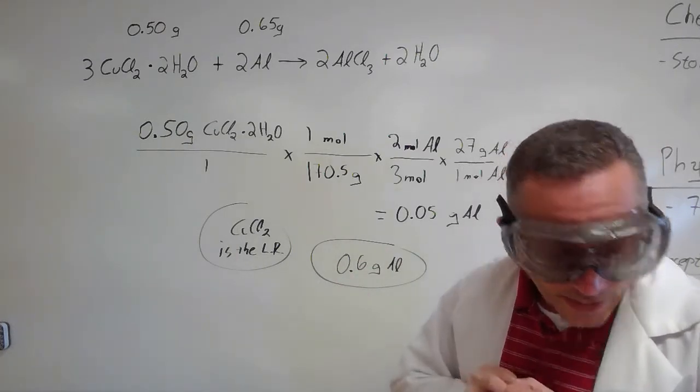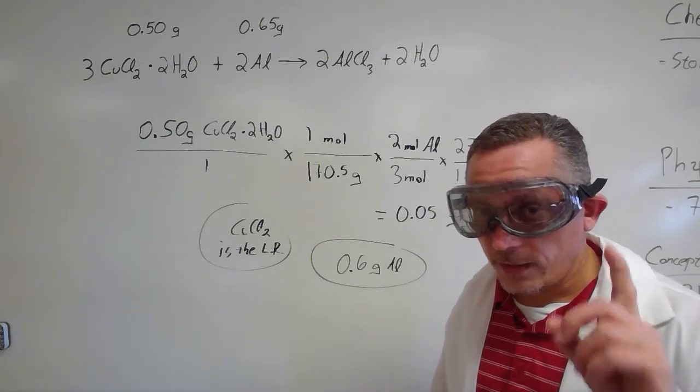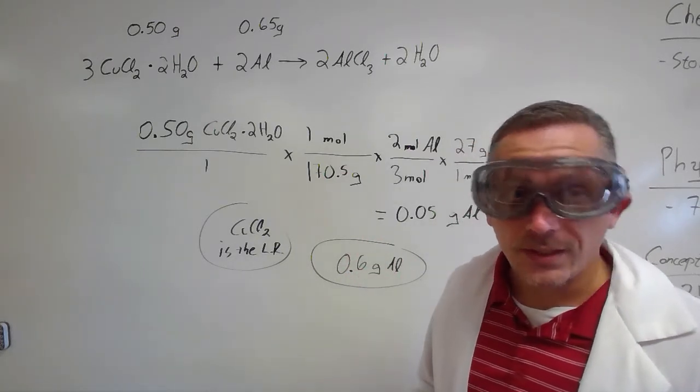So what I'm predicting right now is after I do the reaction and I weigh that aluminum wire afterwards, it's going to weigh 0.6 grams. We'll see if it actually does.